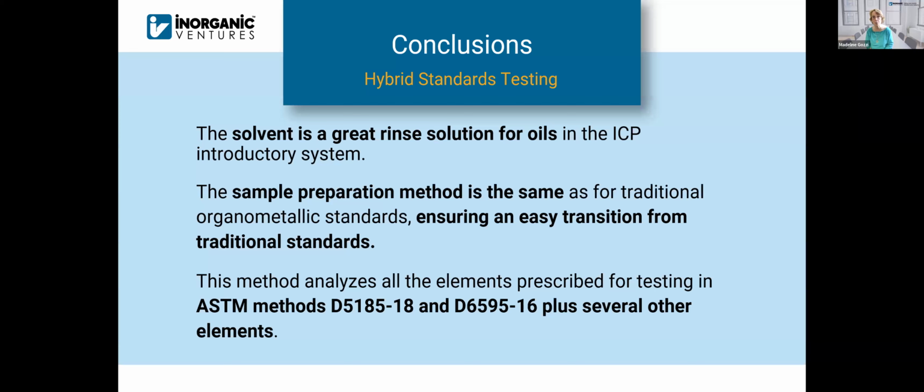The solvent is a great rinse solution for oils in the ICP introductory system. This is really important. The sample preparation method that we used is identical, actually, to the sample prep method that's often used in traditional organometallic oils testing laboratories. This was done deliberately to ensure an easy transition from using traditional standards.